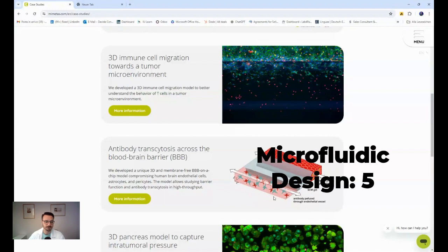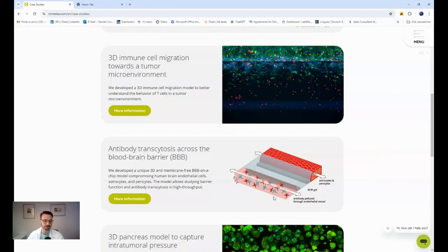In terms of integration and connectivity, the kind of customization that you can have outside the system is not incredibly big, also because the system is not depending on any kind of machine, but this also makes it quite flexible, because you're not relying on other devices.